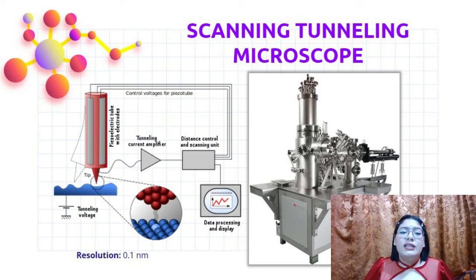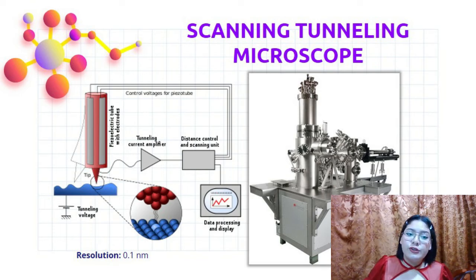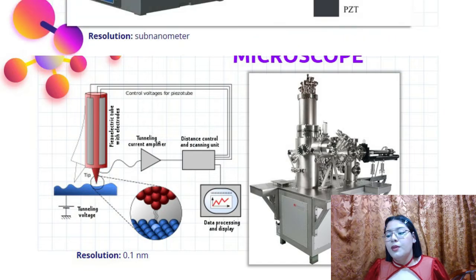It also allows individual atoms to be manipulated, making it essential in the characterization of materials, in the development of nanotechnology, and in the understanding of phenomena related to the infinitely small. It should be noted that it has a resolution of 0.1 nanometers.